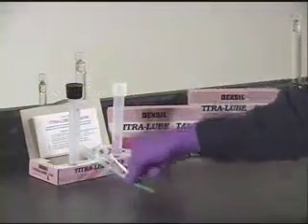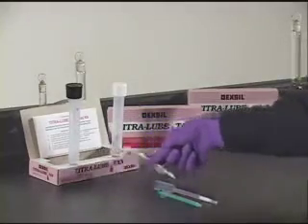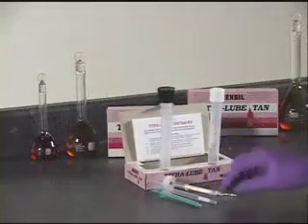Open the kit and confirm that all the components are present and intact. Proceed with the test following the instructions to the step for assembling the titration syringe.